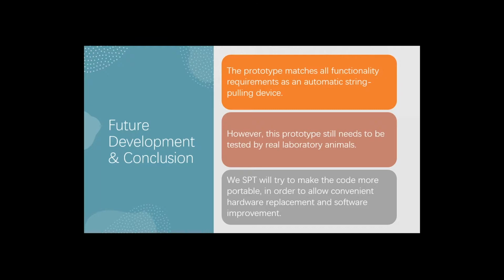Our prototype matches all functionality requirements as an automatic string pulling device. However, it still needs to be tested by real laboratory animals. And even if it passes the real animals test, it still has a long way to go.